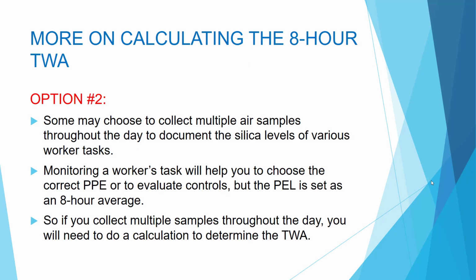Particularly in the construction industry, some people want to collect multiple air samples throughout the day to document silica levels of various worker tasks. Keep in mind that monitoring a worker's task will help you choose the correct PPE or to evaluate controls, but the PEL is set as an 8-hour average. So, if you collect multiple samples throughout the day, you will need to do a calculation to determine the TWA.